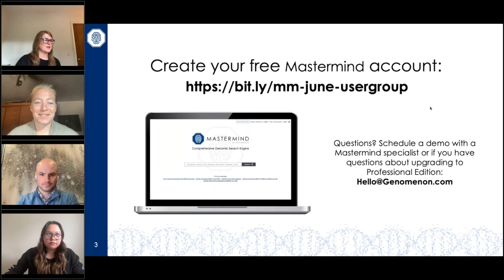Michael wants to know, is there a way to search for small indels in a gene? Yes, I can take this one. You absolutely can. One example that pops into my mind is the CFTR example. You could search that with the c. nomenclature, the HGVS nomenclature, so c.1521_1523del. That kind of structure is absolutely acceptable and recognized in Mastermind.